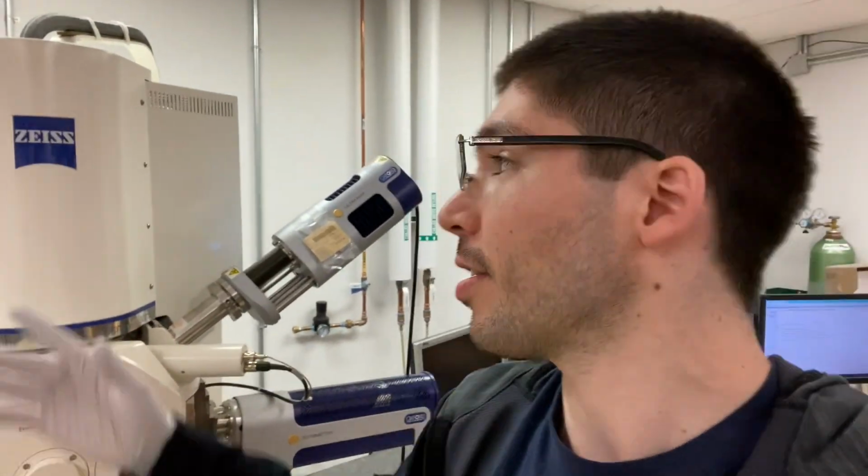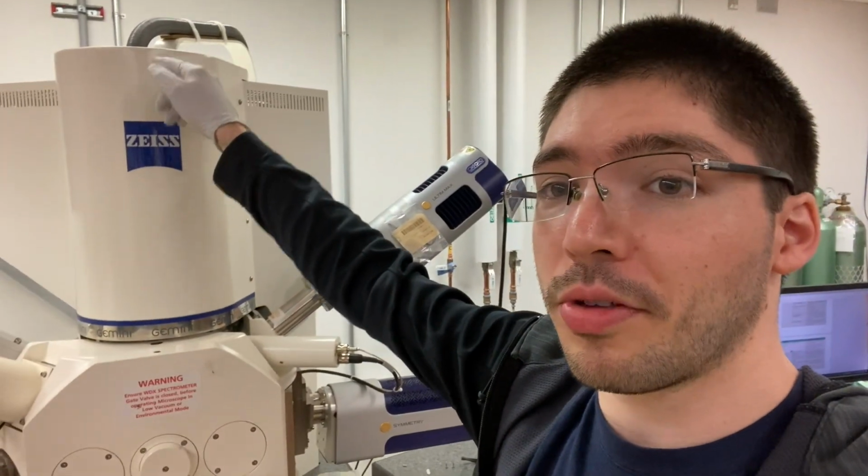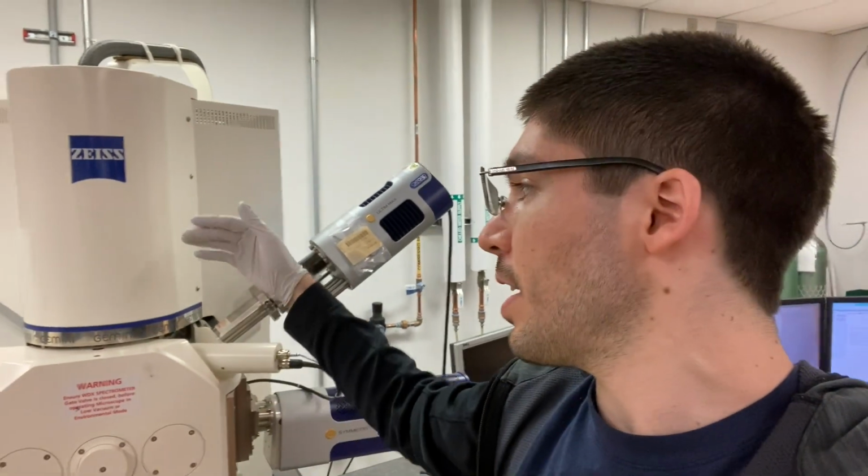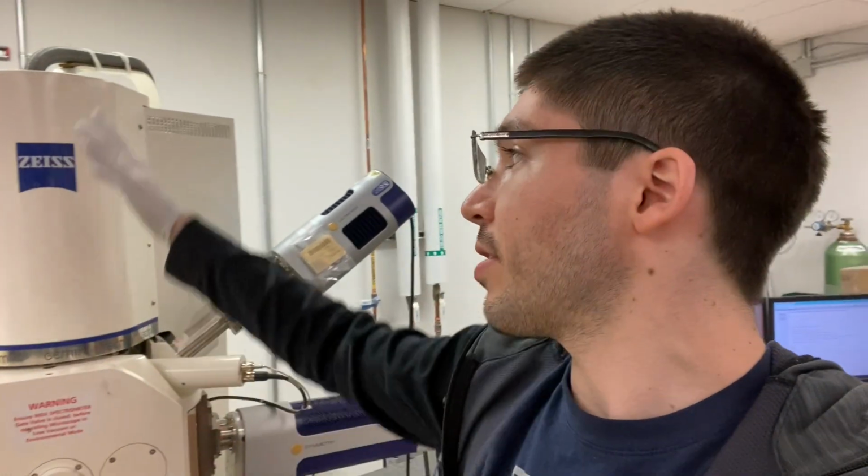This is to make sure that any vibrations caused by moving objects, like the streetcar that passes over, people walking in and out, and all sorts of construction work going on in this room, don't disturb the sample. Essentially an electron source fires a beam of electrons down the column, and any vibrations will disrupt this column of electrons going down, and therefore it'll affect your signal and other things.